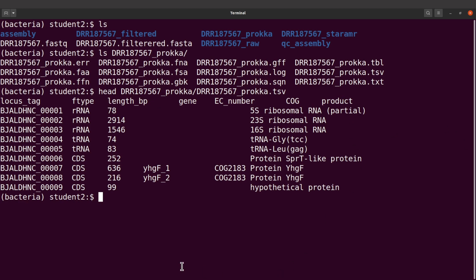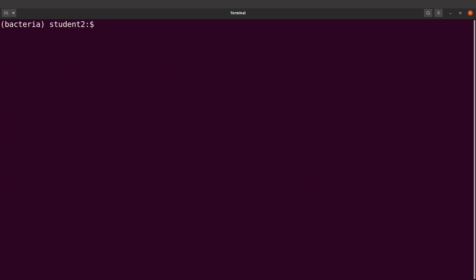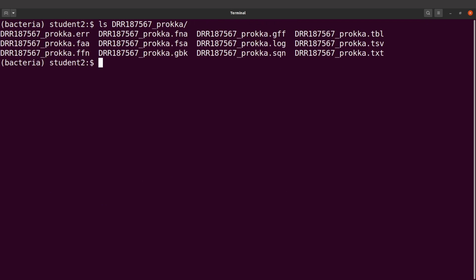All right. So for me, what I'm interested in is to get a summary. How many CDS do we have? How many tRNA do we have? How many genes do we have? So I'll do this. I'll just get the features here. Let's just do this again. I'll do the ls again. So I'll get the features. That's what I want. So I'll use the cut command to do that.